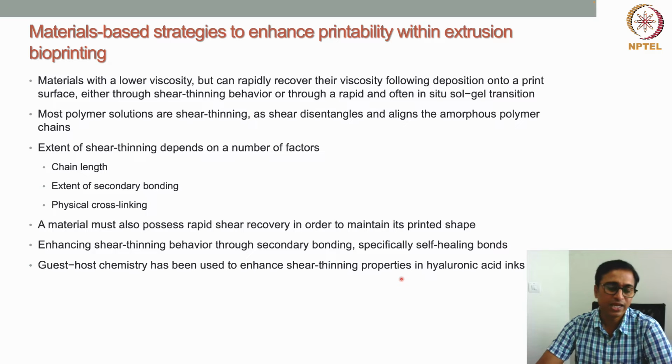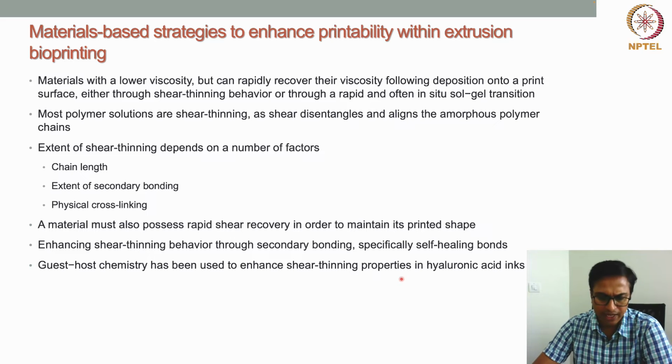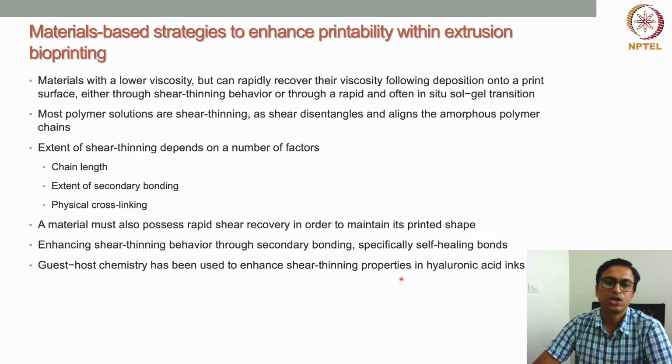In earlier classes we have also discussed that the printability of a material for extrusion based bioprinting can be improved by increasing viscosity, or in turn by increasing the concentration of the material, the molecular weight of the material, and also the networking properties of the material. All these things we have discussed in earlier lectures.